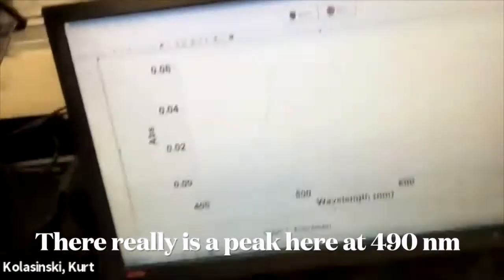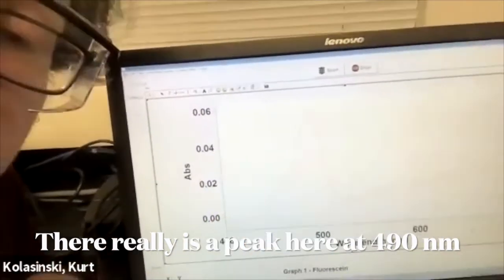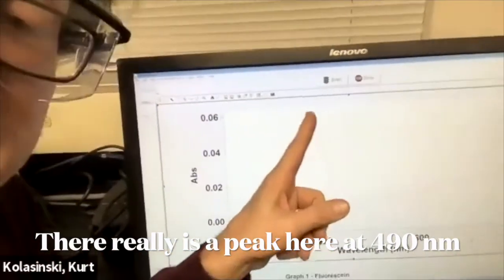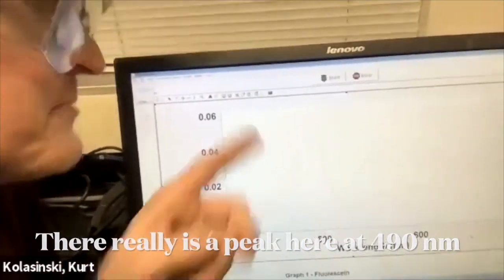There you see it. There's the UV-Vis spectrum of fluorescein. We're going to excite at the absorption maximum. That's at 490 nanometers.